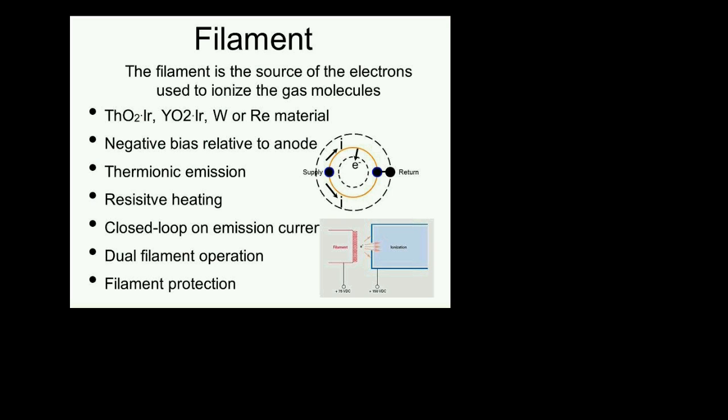The other thing that I'm going to recommend, if you're ordering an RGA, is to make sure that you buy a unit that has dual filament operation. In other words, filaments will break sooner or later. It's a matter of time and temperature. And if you have two, then it's like having a spare in your car. So my recommendation would be don't buy an RGA that does not have a spare filament. That way, when the main filament goes, you can activate the spare filament and order a replacement while that one lets you limp along. Usually, you get very little impact from switching to the spare filament in the device.